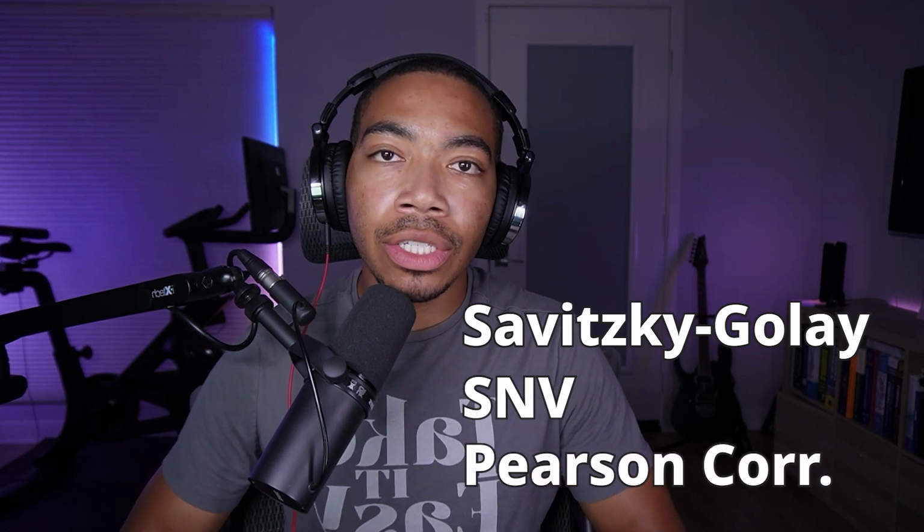In today's video, we're going to continue looking at near-infrared data. And in the last video, we focused a lot on using a combination of signal processors like Savitzky-Golay and standard normal variate to process the data. We then used correlation analysis to remove the bad replicates. And throughout that process, we visualized the changes using a combination of PCA and a scatter plot of that scores data. However, in all of that, we had a few unknown samples that we largely ignored in the last video.